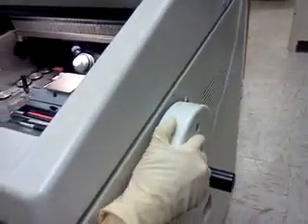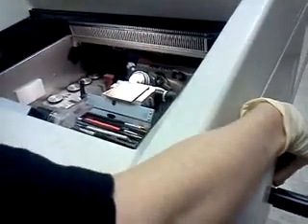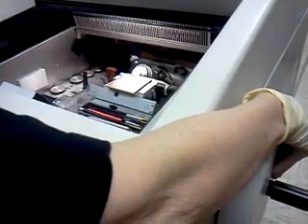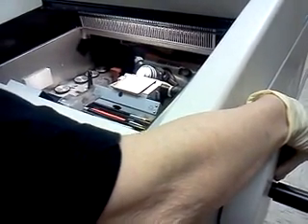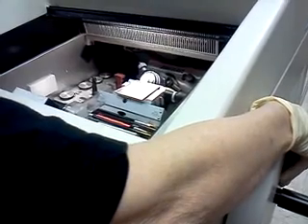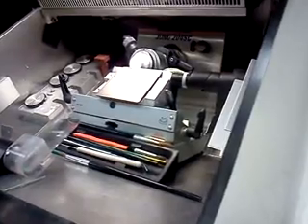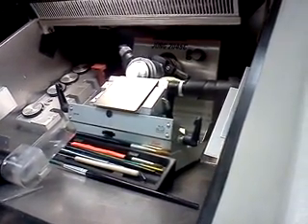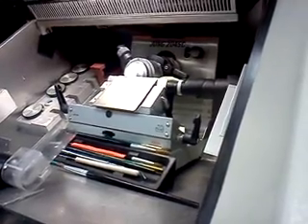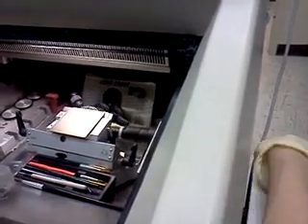Now let's try it. Unlock it. Now, see that? Okay, I went too far. So now what I do is I hit this, and it might come forward without being locked. Okay? Is it coming forward now? It did. Now, see, I'm almost there. In fact, I'm there. Okay?